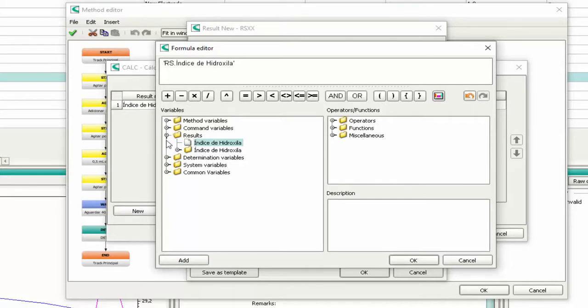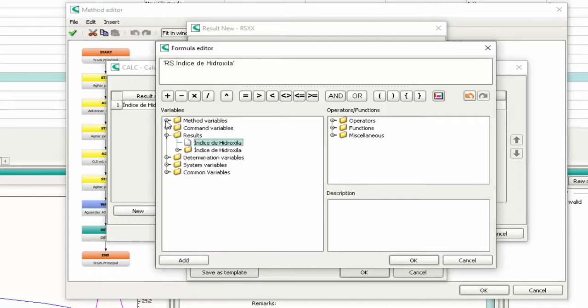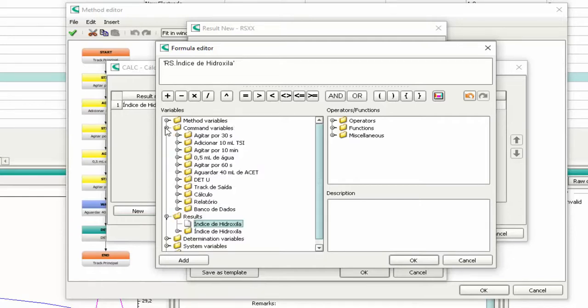There are a lot of possibilities that you can choose to edit your formula. If you need more information about this tool, please contact your Metrohm vendor.